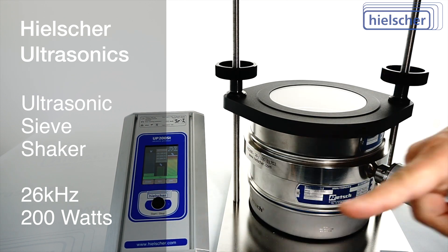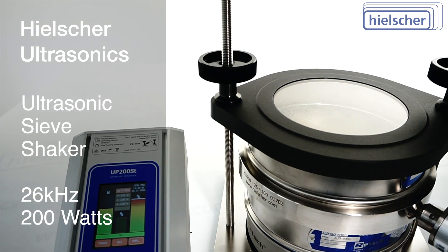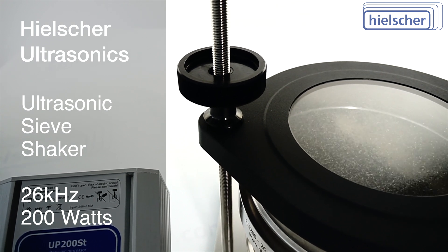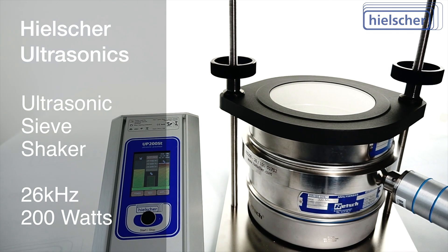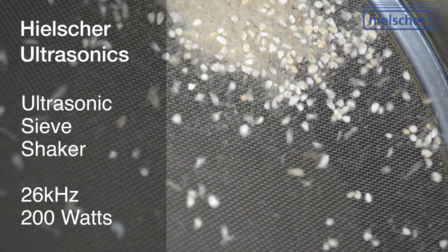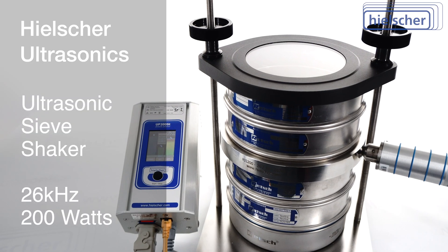Ultrasonic sieving has considerable advantages over traditional sieve shakers. The high-frequency vibrations of the sieve mesh do not cause overstretching of the mesh. As a result, the mesh does not lose its tension prematurely. You can also sieve larger powder quantities at once. Furthermore, the material to be screened is not shifted horizontally over the screen mesh.